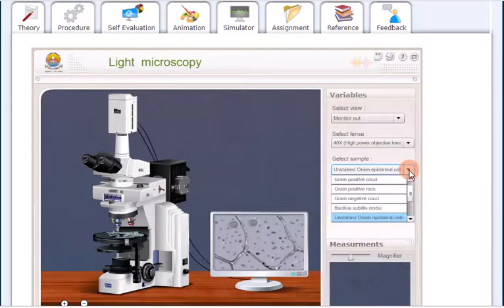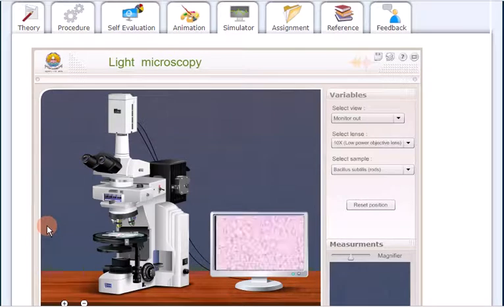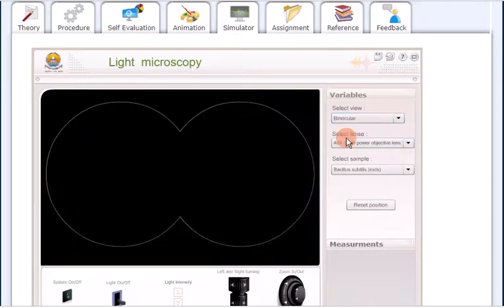And right now I'm using this, let's go for the bacillus cell observations under the microscope. This is how it looks like under the 10x. Now if you go to 40x, it will look slightly different. See, this is what it looks like. Yeah, you can see it. This is how the bacillus bacteria looks like.